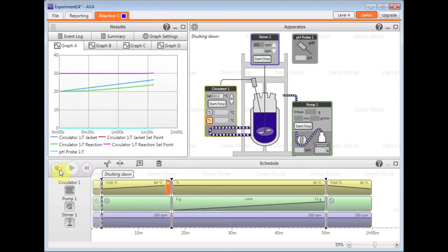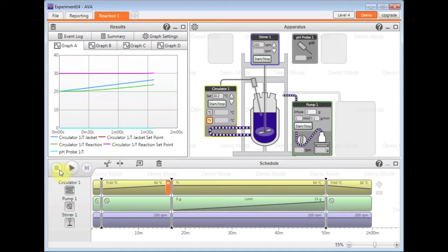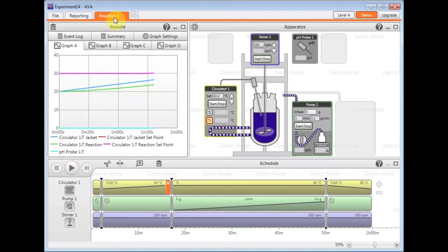I'm just going to stop that one running now. As I mentioned at the beginning, you can control not just one, but you can control multiple, up to four systems as well.